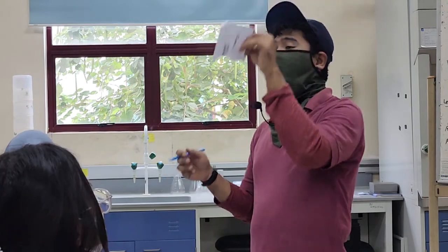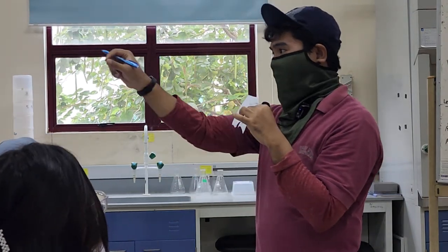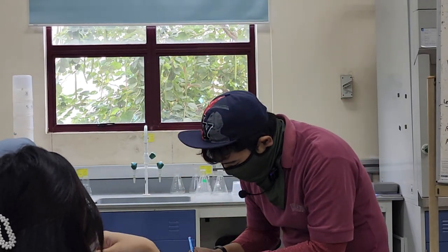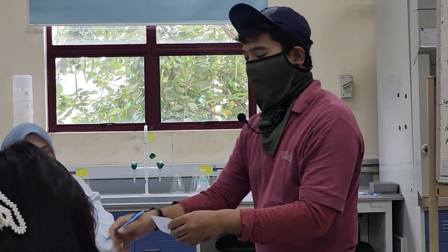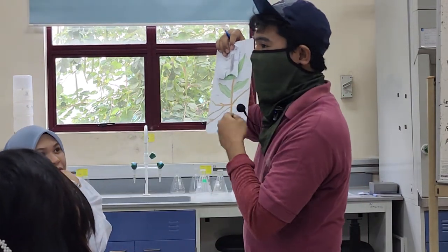And then for the mulberry leaf, when you take the surface imprint using the graphite of your pencil, you can actually see the lenticels here. Once you have this, you label it: lenticel. Cut it nicely, remove all the excess surface, and then stick it to your drawing.